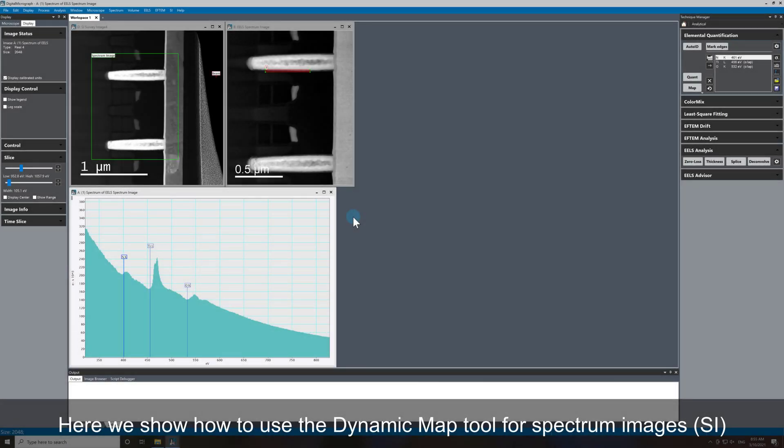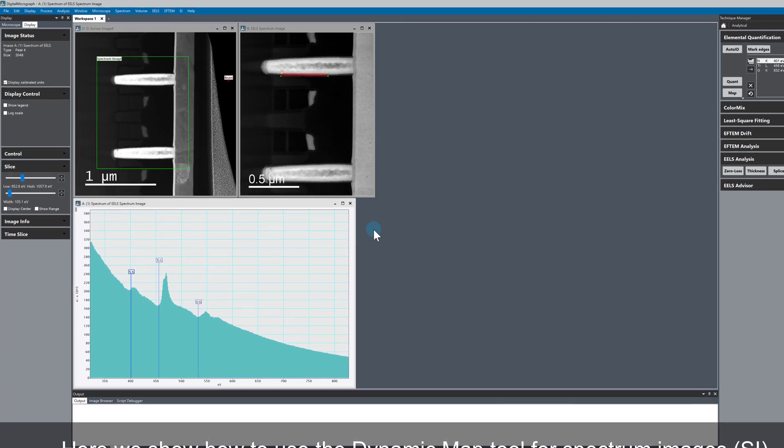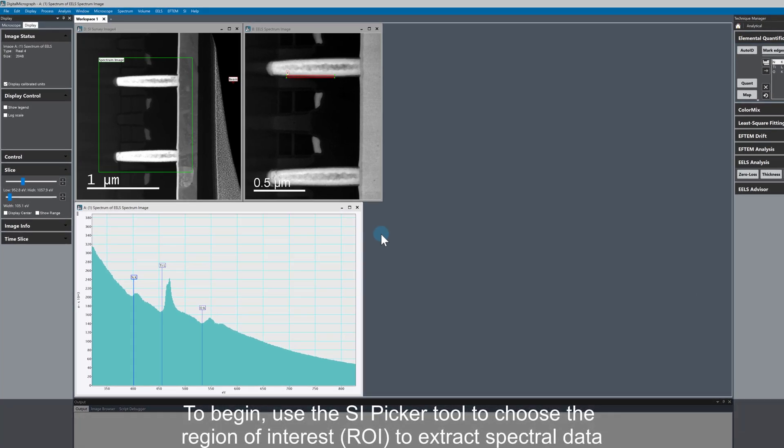We're looking again at this spectrum image of the semiconductor device, and I want to show you how to use the dynamic map tool for spectrum images. The first thing we need to do is extract some spectral data.